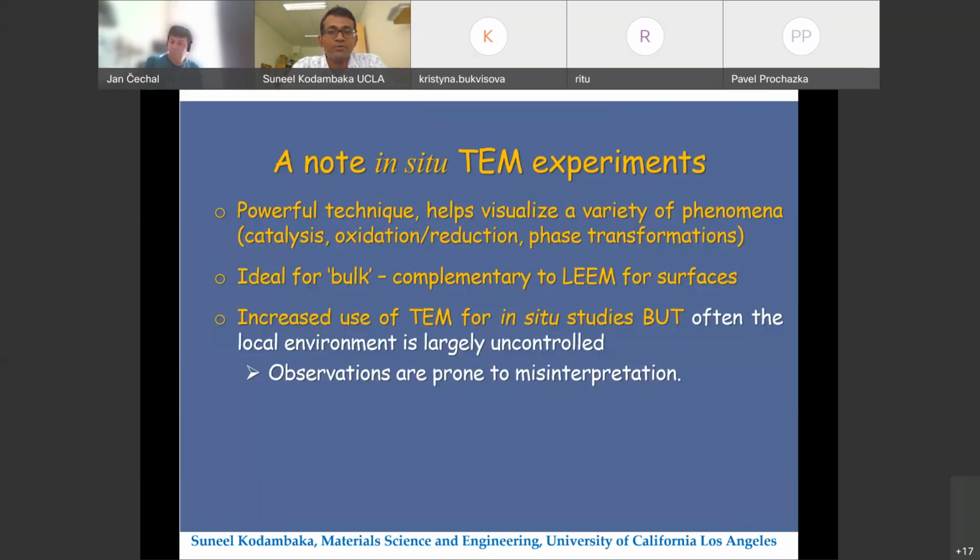So for nanowires, Francis came up with this reflection geometry that helped us use a bulk single crystal to watch the nanowire growth. But if you were to choose a thin film or a thin cross section made using focused ion beam milling, then you end up with gallium contamination, which can lead to gallium surface segregation during heating, which we did observe.